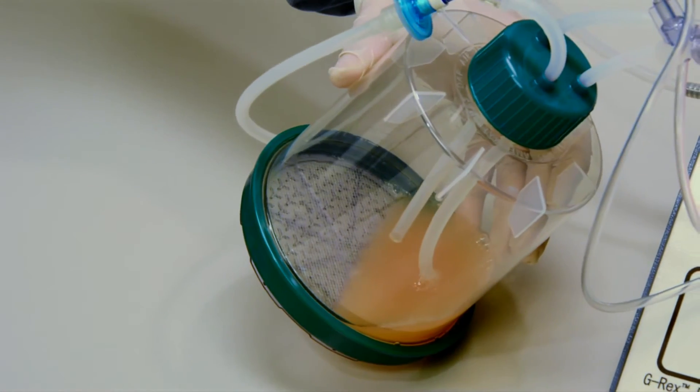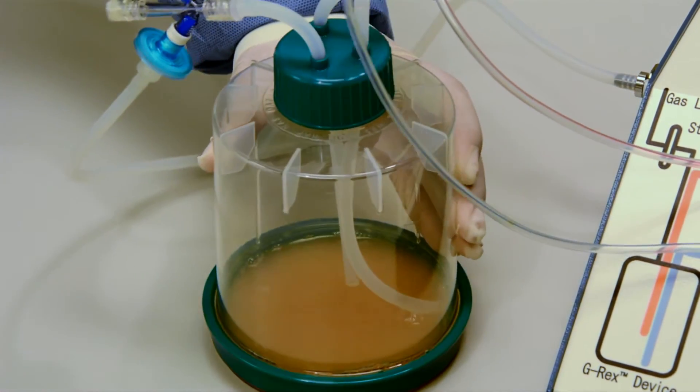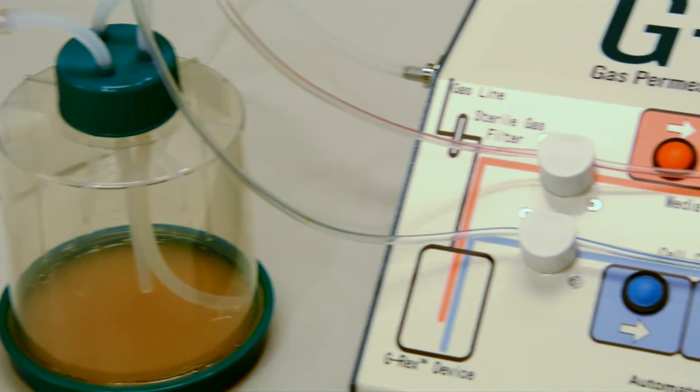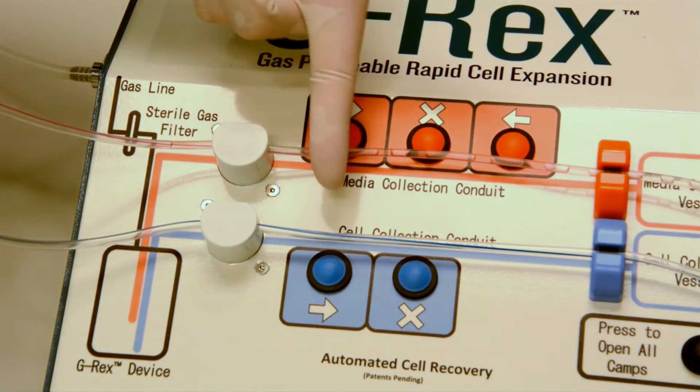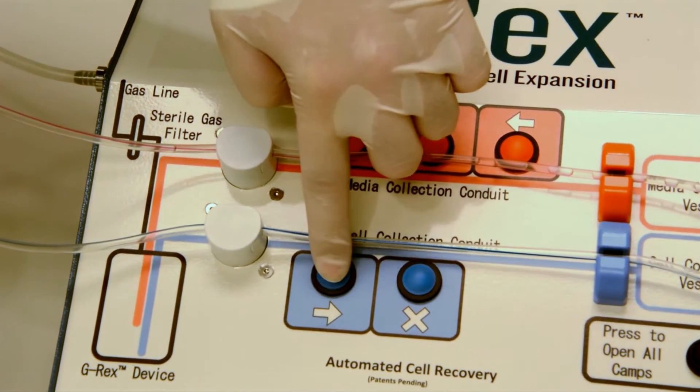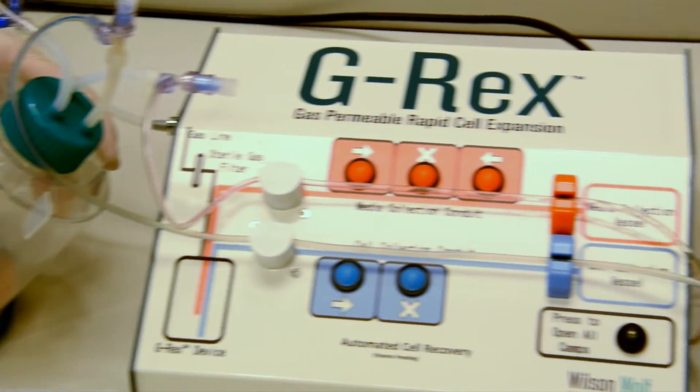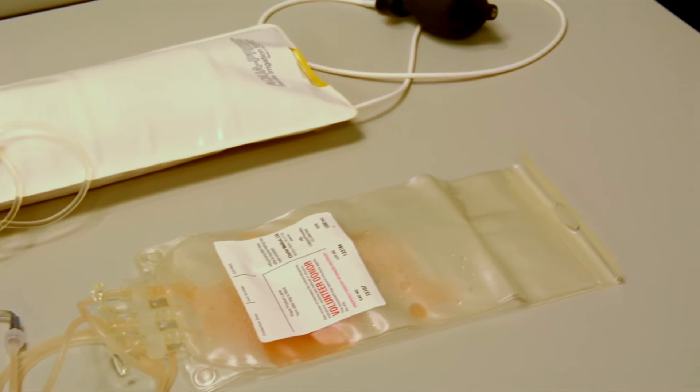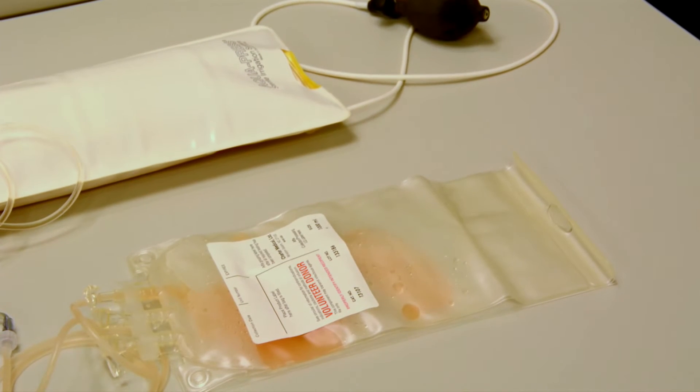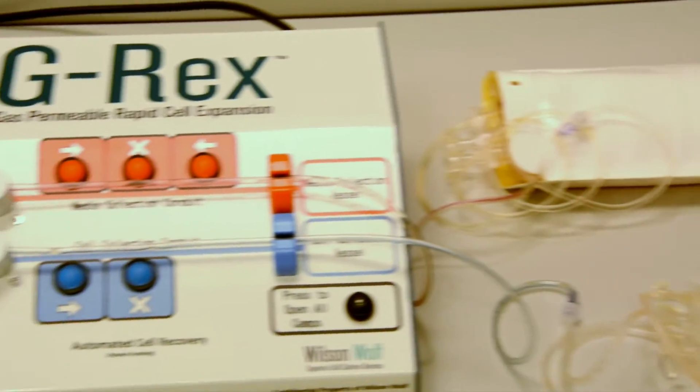After resuspending the cells, we are ready to initiate the harvesting process. By pressing the cell collection button, we allow the cells in suspension to be drawn through the cell collection line. The cells are then drained into the collection bag here, and this process stops automatically when the cell line optical detector senses air and clamps the line.